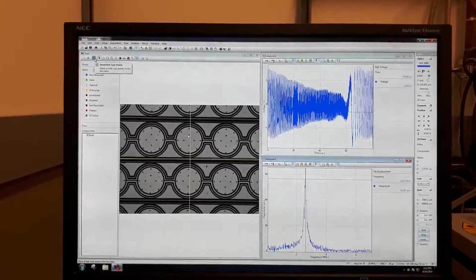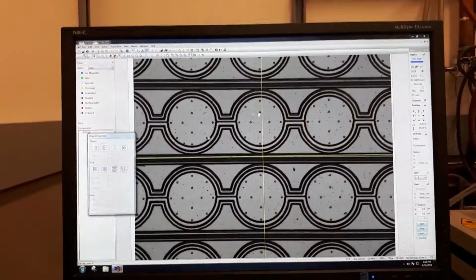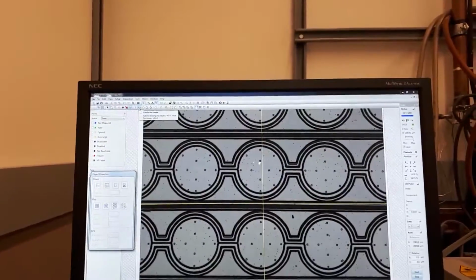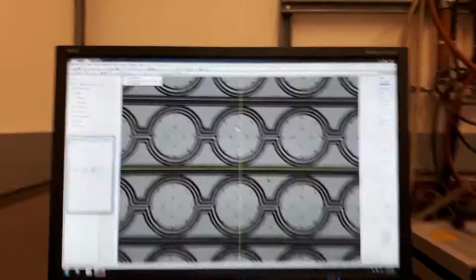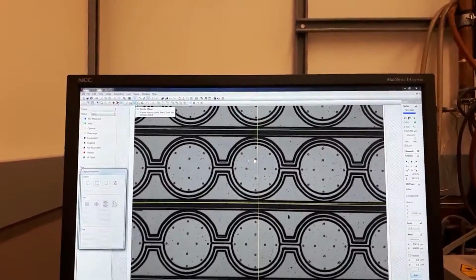So you need to click this button that says define scan points, and it'll zoom in on your video image, and now you have different shapes that you can choose from, and each shape will be filled out with scan points. So I'm gonna use a circular, I think it's a create ellipse.